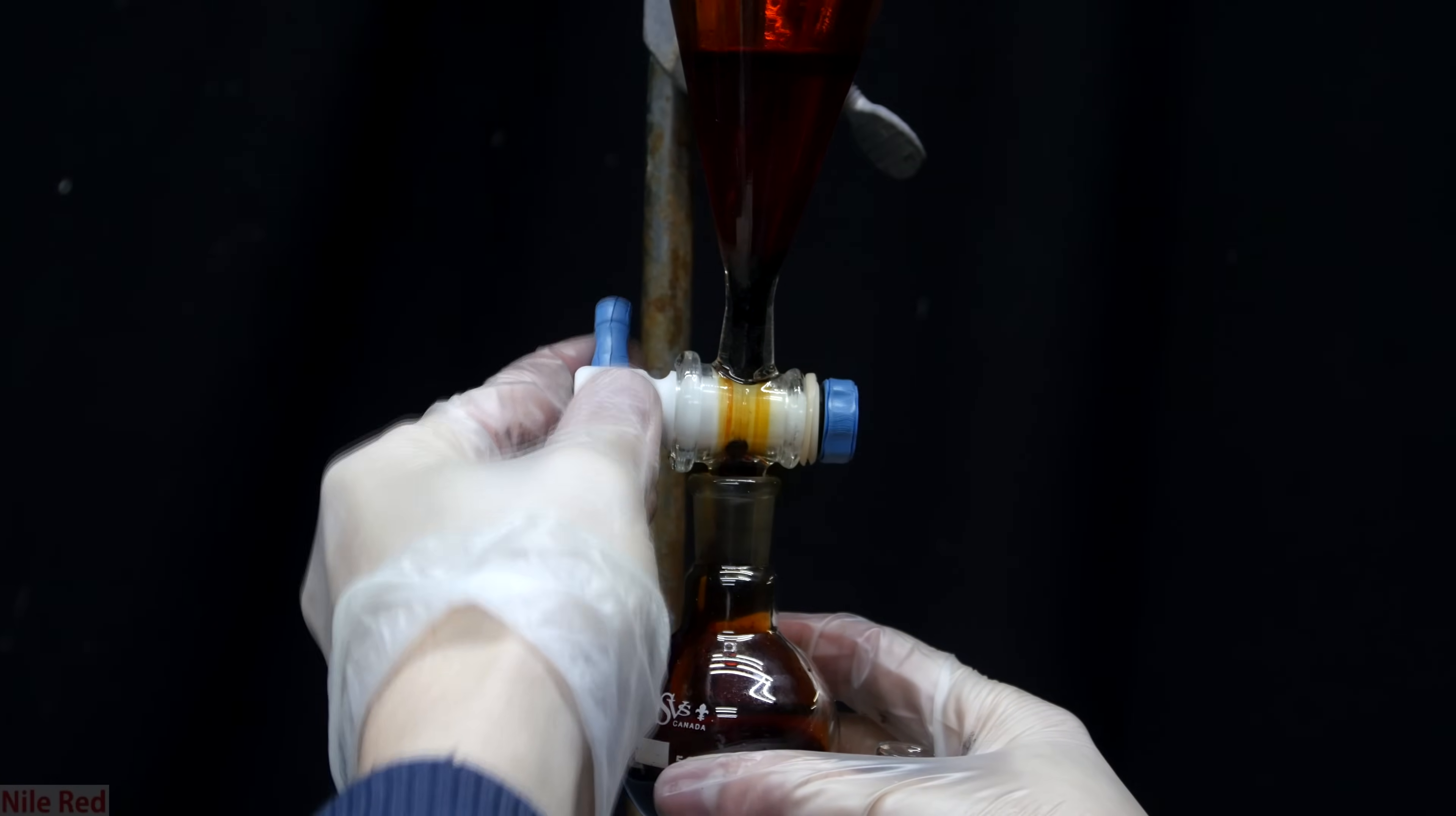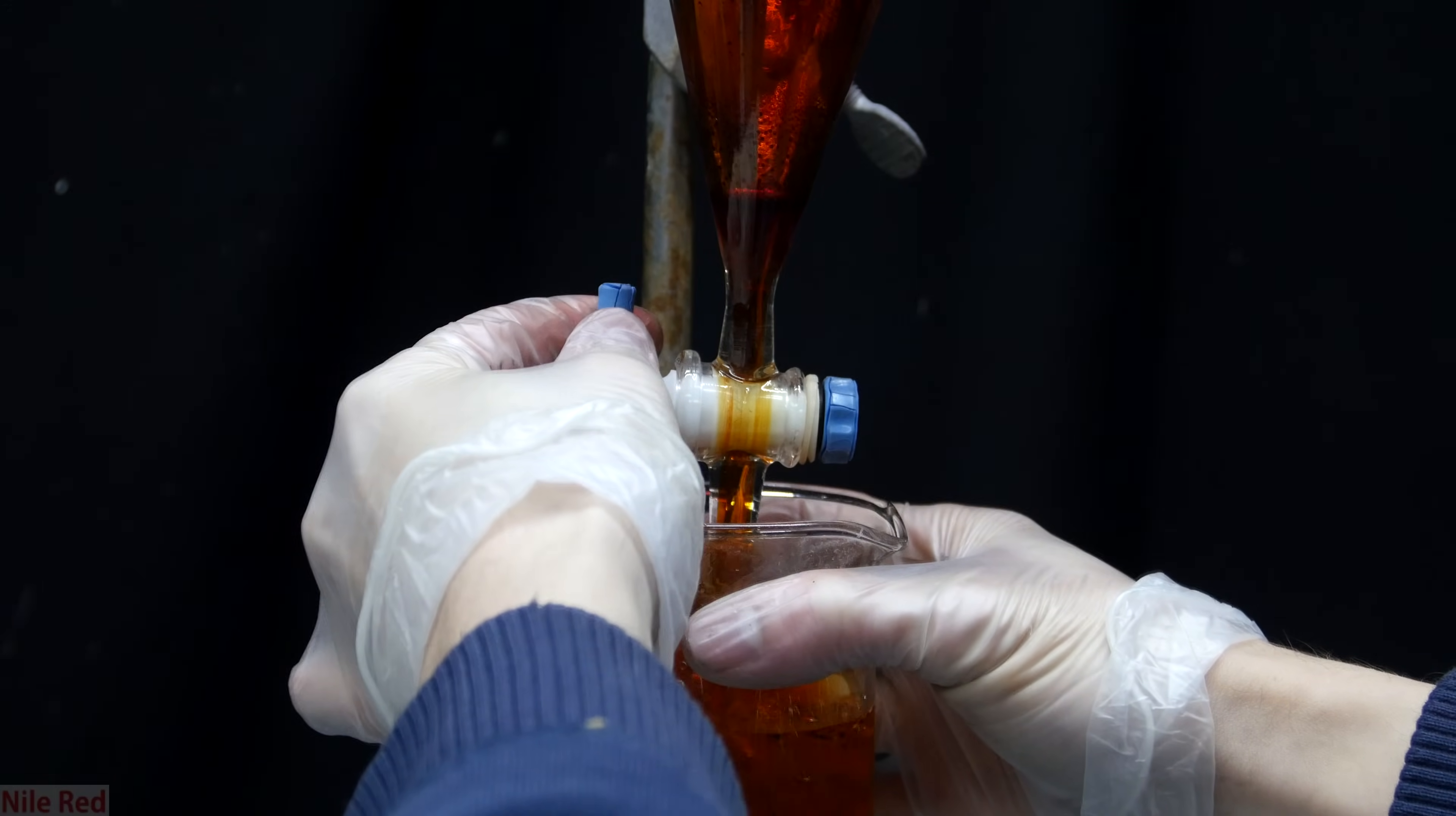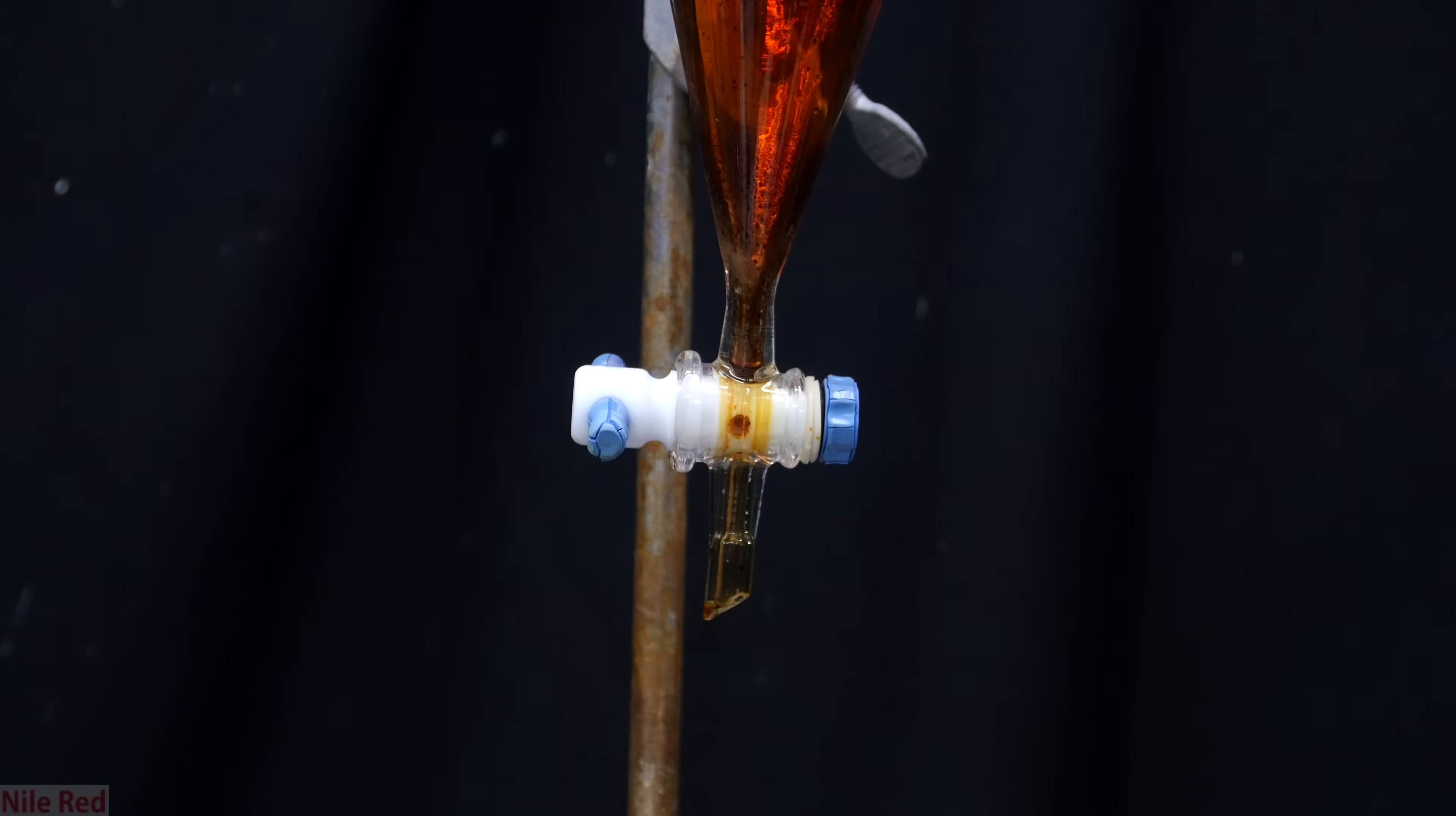Once the layers have settled, we can drain the bottom bromine layer into a round bottom flask. The top layer, which is concentrated sulfuric acid, must be drained into a beaker containing water. Afterwards, we can add sodium thiosulfate to neutralize it but it's important not to put the sulfuric acid directly into a sodium thiosulfate solution because it can react pretty strongly.